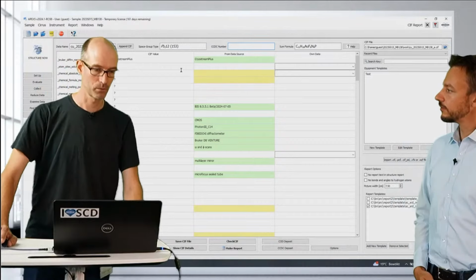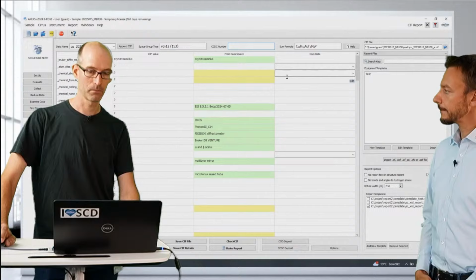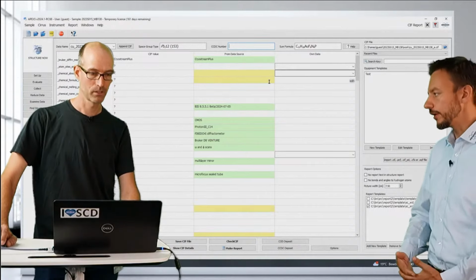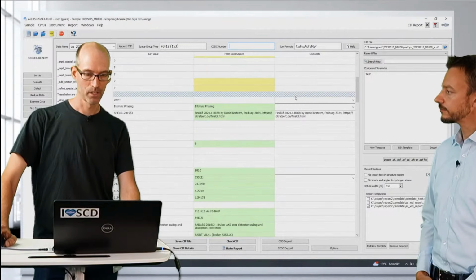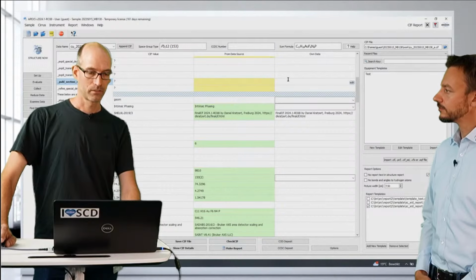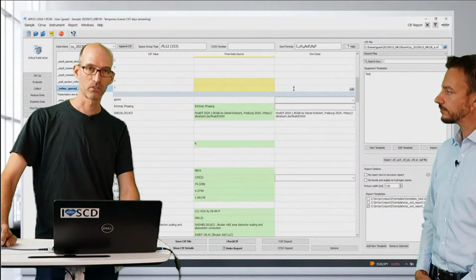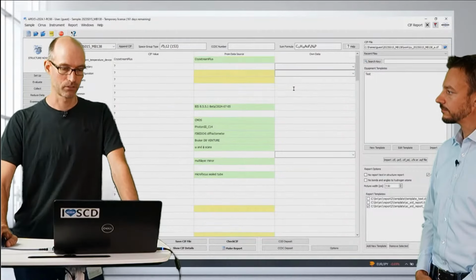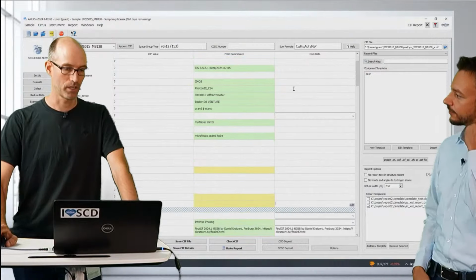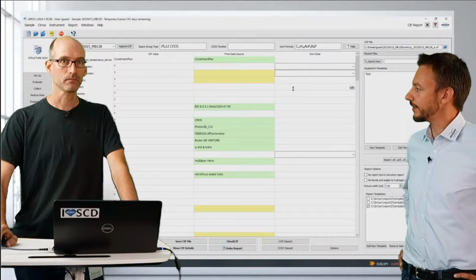In this case it's a non-centrosymmetric space group, so we have to define how the absolute configuration was determined. We have the moiety formula. We have references for the publication and special details about the refinement. So essentially, not much. Four items. That looks really, really cool. So that will make my day way easier.